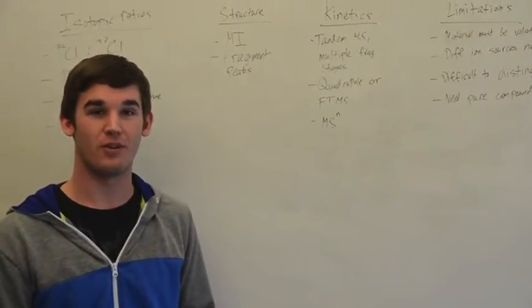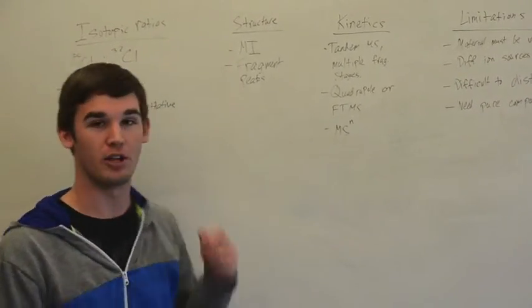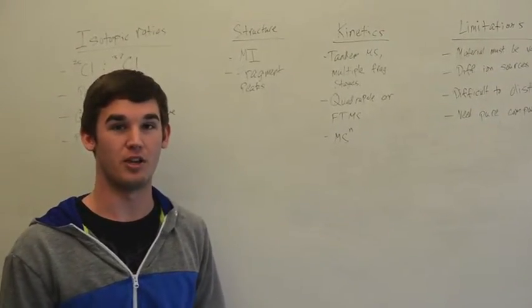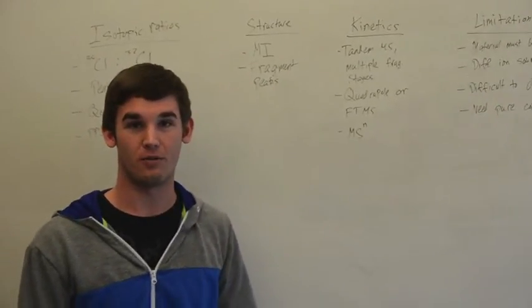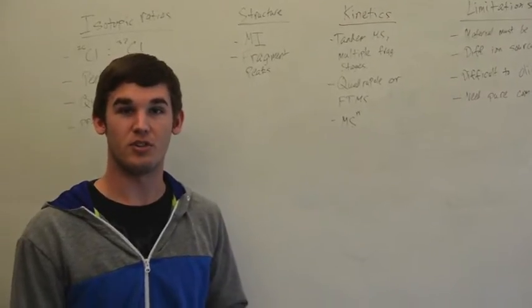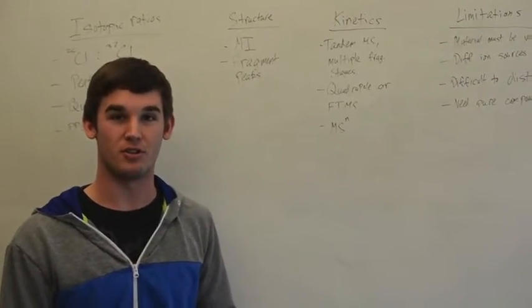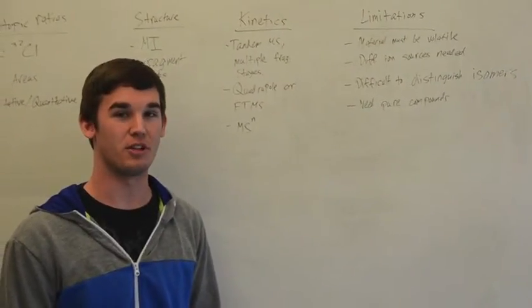When you want to identify the molecular structure of your compound, it is really helpful if you can identify the molecular ion peak, which is your total molecule in its ion form. If you can't identify the molecular ion peak, it is still very helpful to identify fragmented peaks, which have come from ions that have fragmented off the total molecule. Using a basic knowledge of chemistry, you can assign different peaks to stable ions, and hopefully from there determine what your molecular structure is. Reaction kinetics can also be studied with MS.